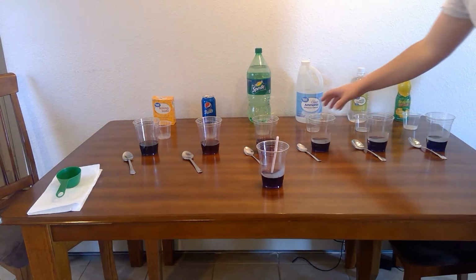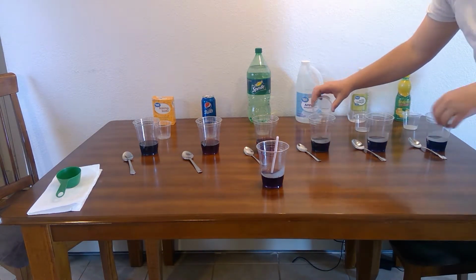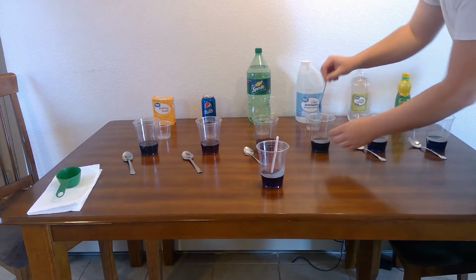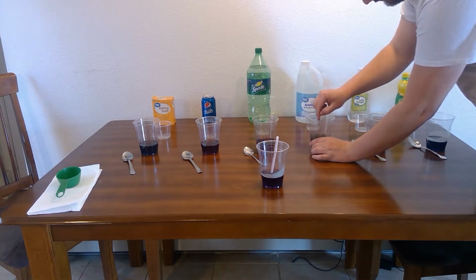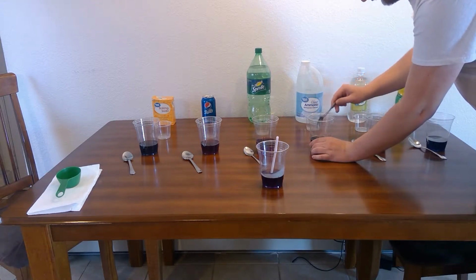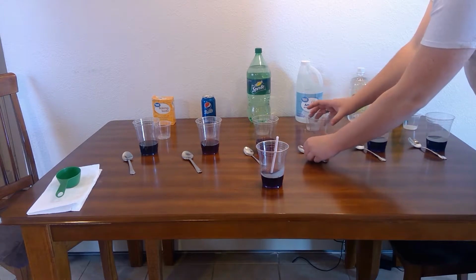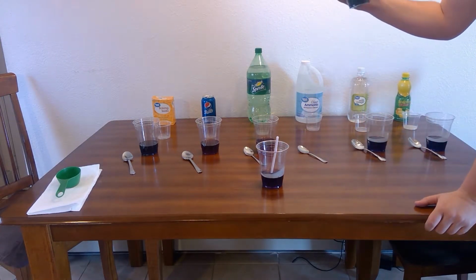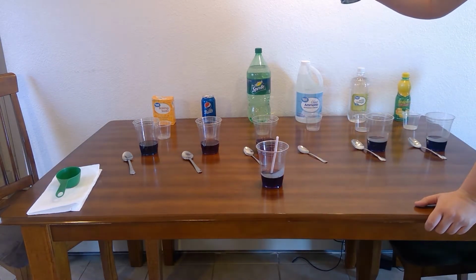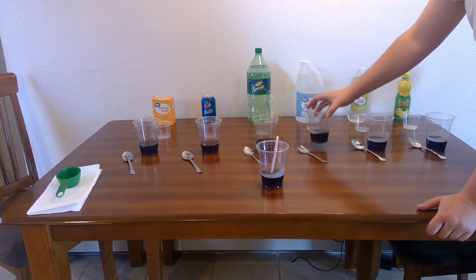Next is the ammonia, which smells awful. Alright, that one's really close to the baking soda, but it is more of a green instead of the blue that one is.